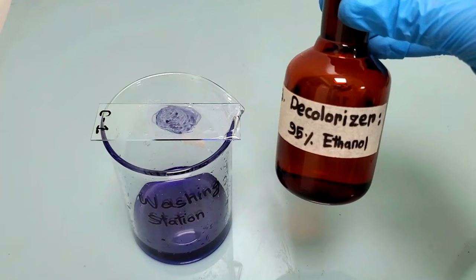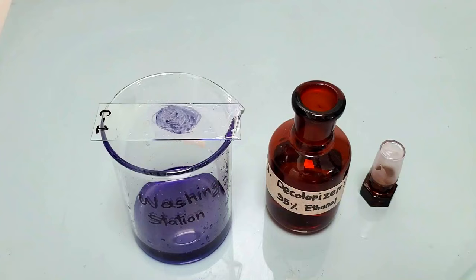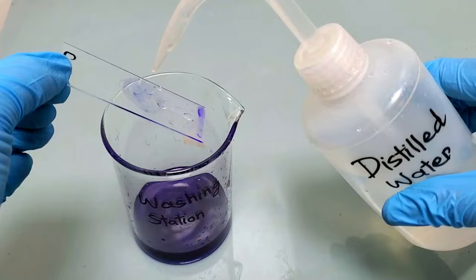In this third step, we will decolorize the smear with 95% ethanol for a very short period of time. Add a few drops of 95% ethanol and wait for 10 to 15 seconds. Immediately wash the slide with distilled water.